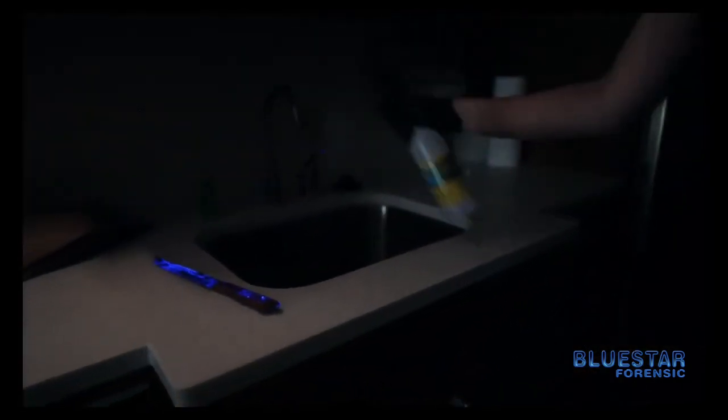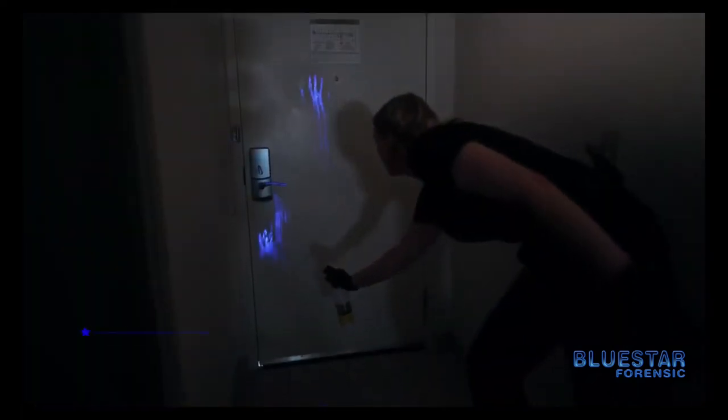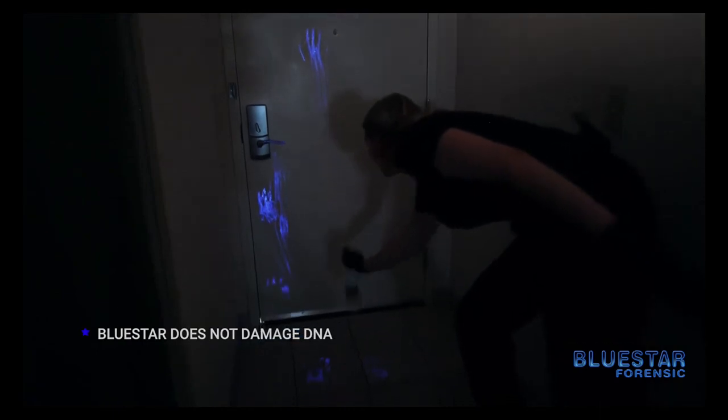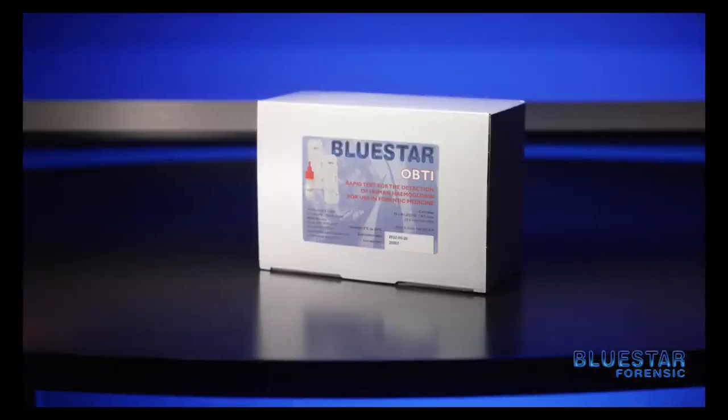Once you apply Blue Star and you observe a luminescence, you want to test that area. Fortunately, Blue Star does not adversely affect DNA. If you believe that your Blue Star is reacting with a different type of blood other than human blood, that is an area where you could use Blue Star Identiheme or Blue Star OBTI to test that area to ensure that it is in fact human blood that you're looking at.